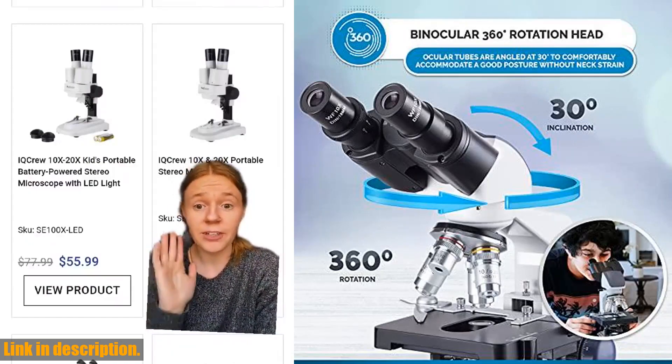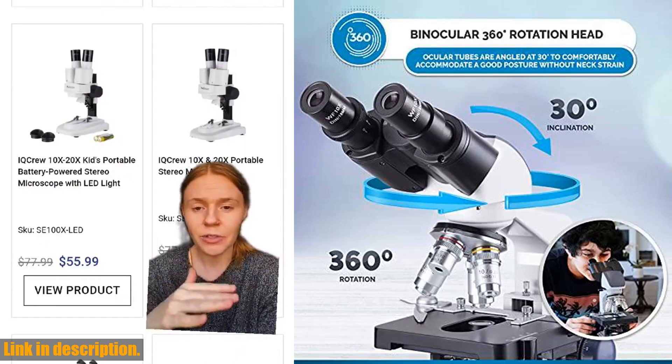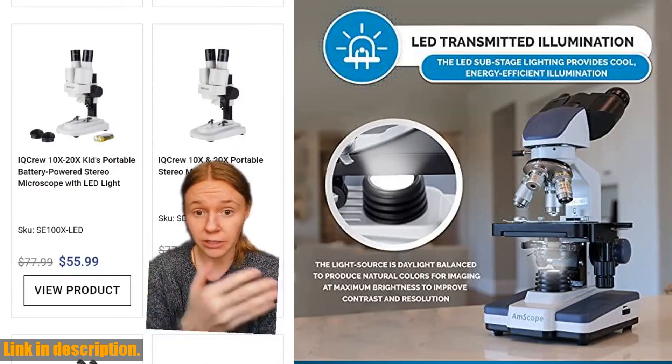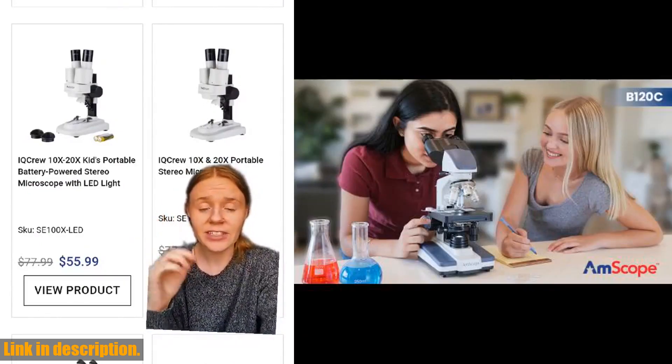With a forward-facing nosepiece in 4x, 10x, 40x spring, and 100x spring oil dinachromatic objectives, the B120C provides color correction and clear examination at five different magnifications.